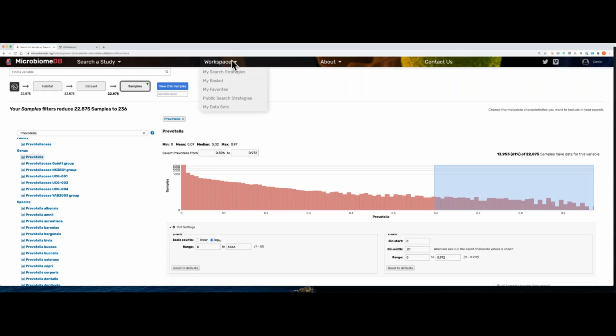So this may answer one of the questions while you're loading. One additional question came in: how does what MicrobiomeDB offers differ from QIIME? Right. We actually use QIIME in our data processing pipeline that happens before data actually appears on the site. So all of the data you're looking at has been through a QIIME pipeline, but what we offer is what you do after that.